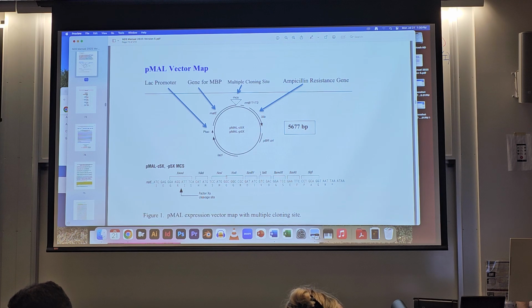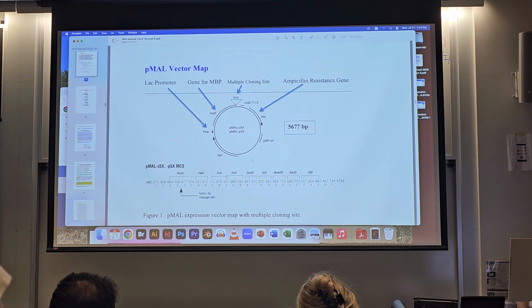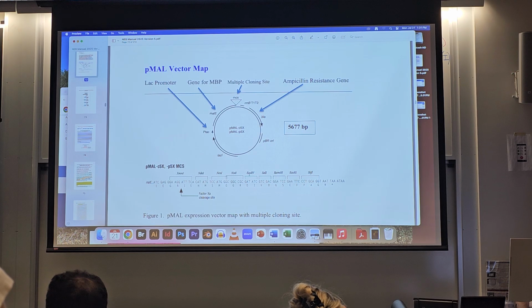Now we believe we successfully replaced it with our GAPDH cDNA because on your gel you saw a PCR product of this region that was the right size had you inserted the GAPDH cDNA successfully in there. Remember, this was your 8-colony PCR, and you had plenty of colonies that looked like they had the exact right size in the plasmid. So we believe we're okay. We believe we're in good shape.